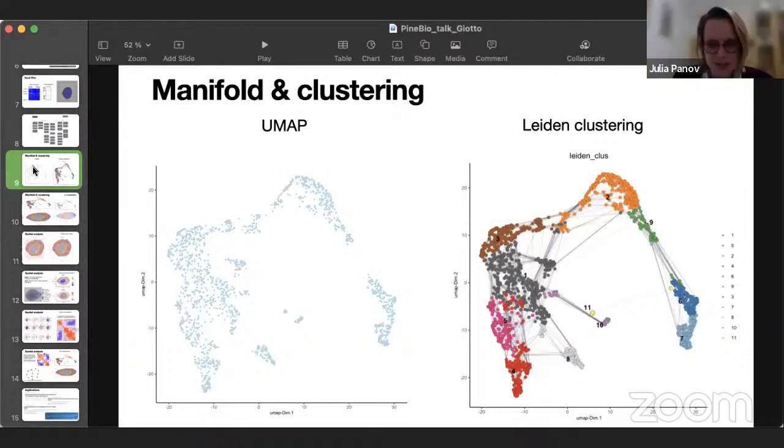I would also suggest that there is no right embedding. It's an important thing to remember that each of those embeddings is going to be somehow right and somehow wrong. It will preserve some of the hidden structure of the data, but it will lose some other hidden structure.